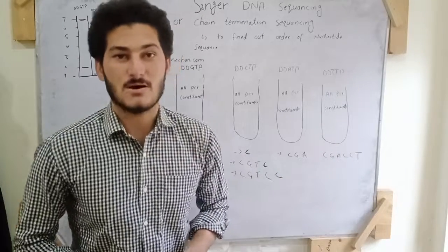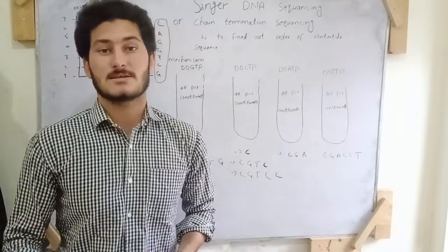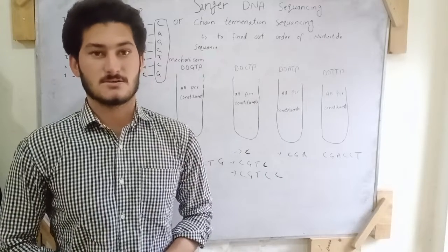Bismillahirrahmanirrahim. Today we will discuss the Sanger DNA sequencing process. The Sanger DNA sequencing process is also known as dideoxy DNA sequencing or chain termination sequencing.